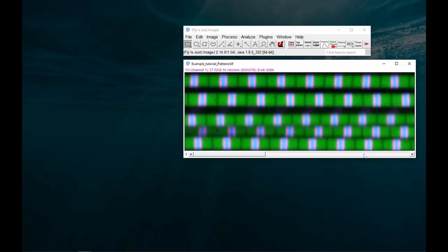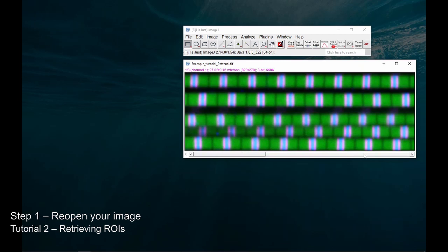You probably realized that when we pressed the Extract and Save button, the ROI Manager window opened and a new ROI was added each time the button was pressed. It is the case because selections are saved at the Extract and Save step. It is possible to retrieve these selections with a dedicated function.